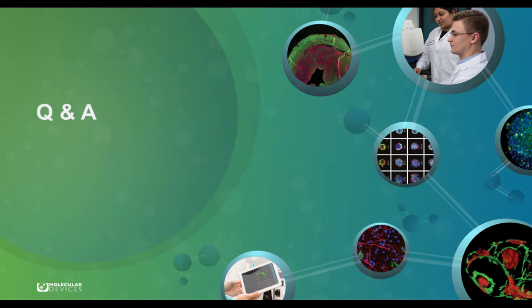Dr. Tang, we have time for one final question, but I do want to remind our audience that those questions we are unable to answer today during our live event, and those that are submitted during the on-demand period, will be addressed by Dr. Tang via the email address you provided at the time of registration. Dr. Tang, can the data files in Data Selector be removed?